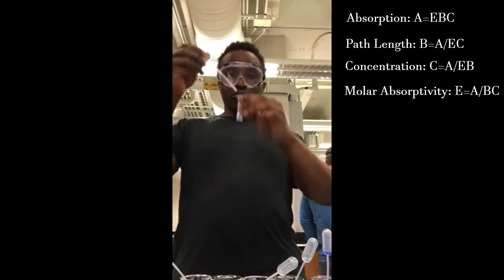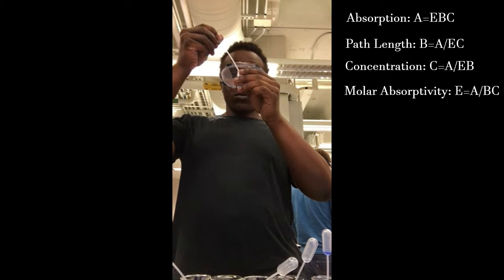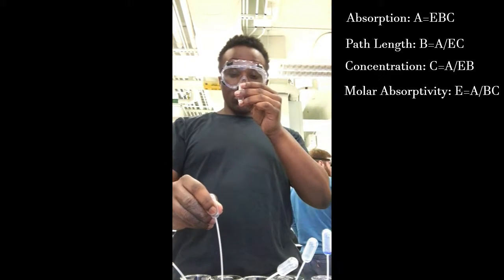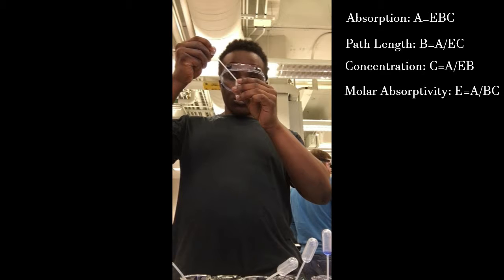Notice how he is looking at the cuvette. This allows the student to transfer an accurate and sufficient amount of solution into the cuvette. By following proper lab procedure, the student will not overflow the cuvette.